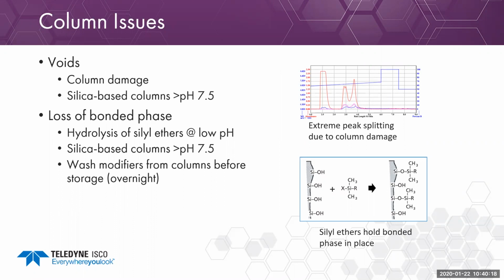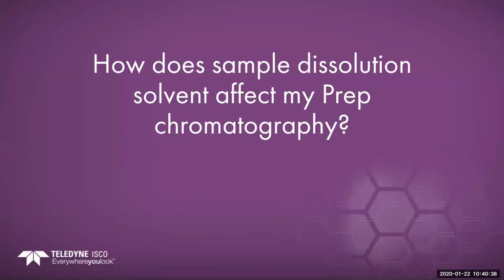The thing is, at low pH, silyl ethers hydrolyze, so being in the correct pH range for your compounds matters. Loss of the bonded phase is going to cause peak splitting issues and poor retention. And it's good to wash the modifiers from our columns before storage overnight.